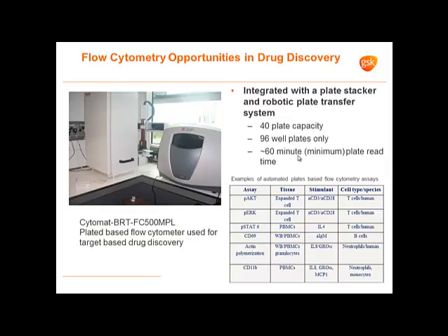However, the throughput was slow and low. A plate would take at least an hour to run, and often longer than that. Sometimes it took 2 hours. Hence the reason why the refrigerated stacker was important, not just because you set up an experiment late on a Friday afternoon, come back on the Monday and find out it's actually stopped halfway through it. But anyway, with that system, we had some success at doing some routine drug discovery, particularly for target-based drug discovery.